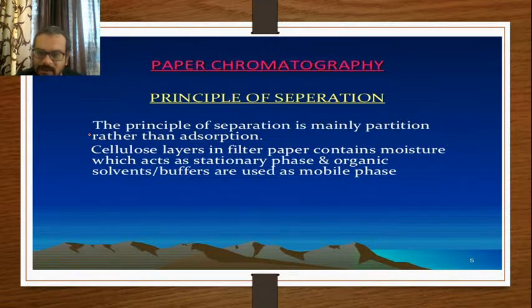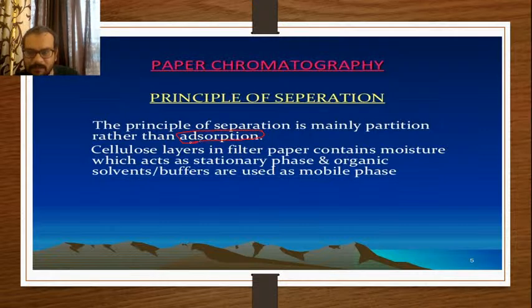No need to explain, the principle for the separation is mainly based upon partition rather than adsorption, but that doesn't mean adsorption is not a principle of paper chromatography. If you are going for the paper as a stationary phase, which is a solid one, there is a principle called adsorption, but for most practical purposes, when we say paper chromatography, partition is the best or most widely used principle.